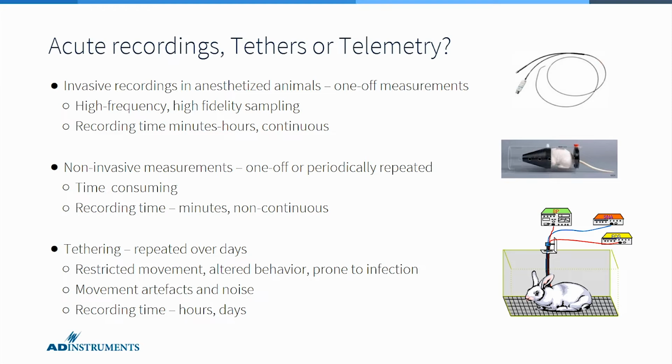Recording time with this is perhaps up to a few hours a day and can be repeated over a few days or weeks if you're lucky that your signal is maintained. But a researcher has to be present throughout all of those recordings, watching that animal during all of that time. So again, they're quite time consuming.